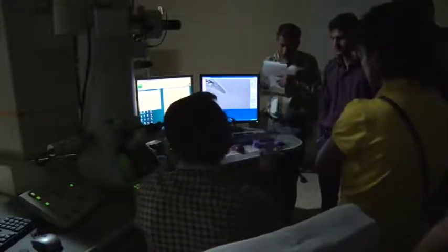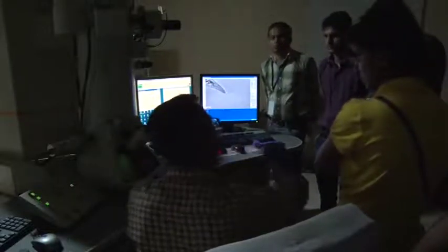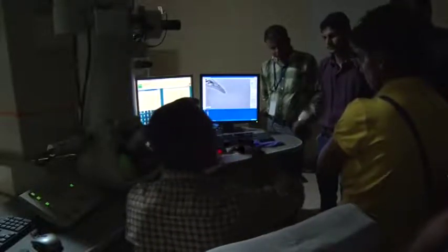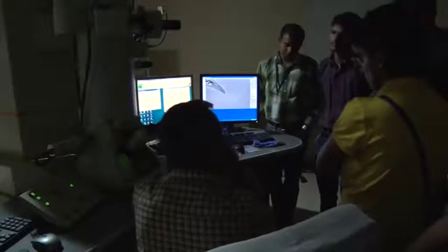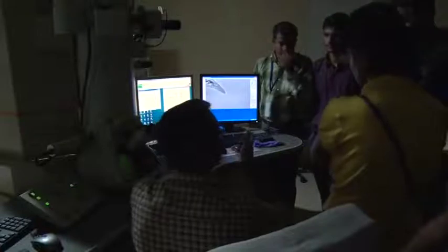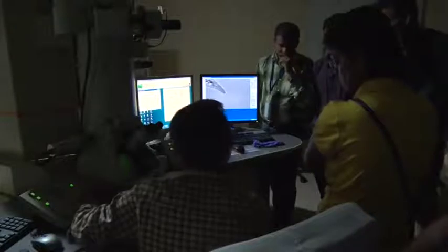The other way of doing it is you try to have some amorphous sample, a carbon foil for example, or this STEM grid, which has a lacy carbon film that's amorphous. On that you acquire the Fourier transform, the FFT, of the images live. Then you get the so-called FFT, fast Fourier transform, and that will show circular rings. If there is astigmatism in the objective lens, then it will show not a circular FFT but some preferential direction, it will be elliptical. So that you have to eliminate. From elliptical, you make it circular by changing these knobs here.